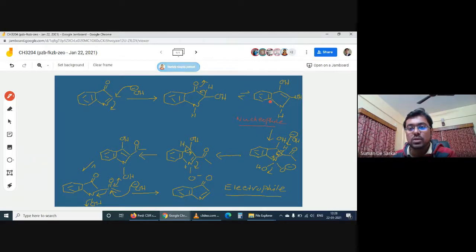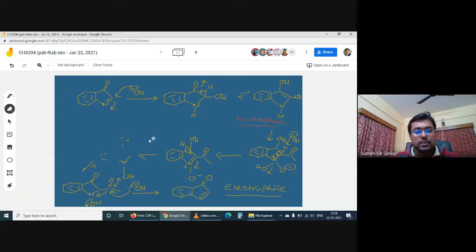So once we have both the species in the medium, nucleophile and electrophile, then what will happen? They will couple with each other. See now. Let me create more space. Although I'm telling this, I don't know how long I have spoken already, maybe 10 minutes, but you will see in the video, once we mix, immediately it will happen, within not even a minute, within a few seconds, because these reactions are very, very fast.